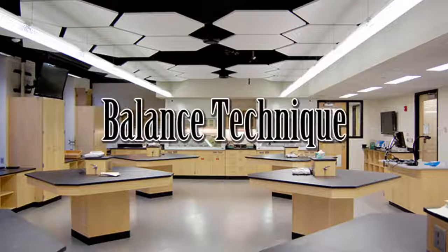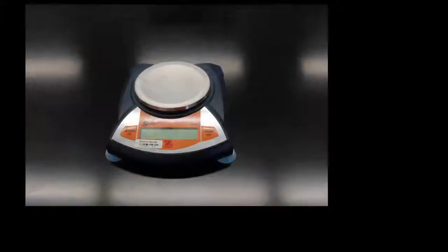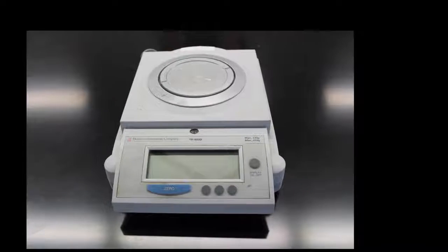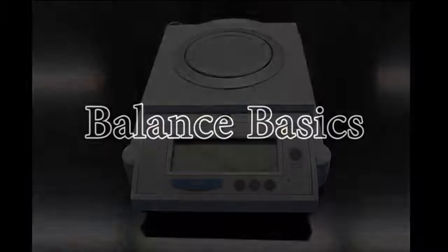In this video we are going to go over the proper techniques for using a balance. There are a wide variety of balances you will use in your scientific career at UNL, but they all function basically the same. Let's focus on the balance that is used most in the undergraduate labs. There are a few things you need to know before using your balance.